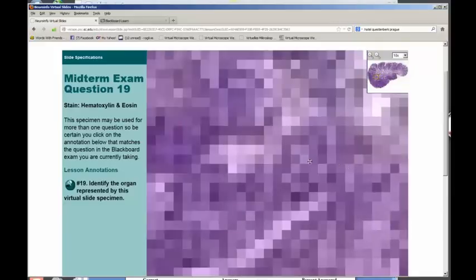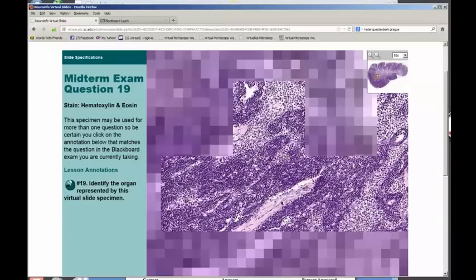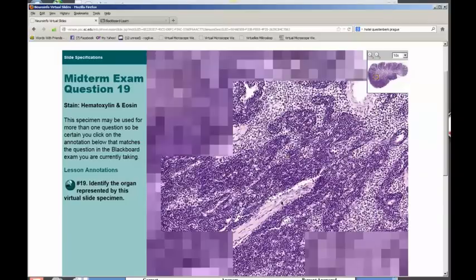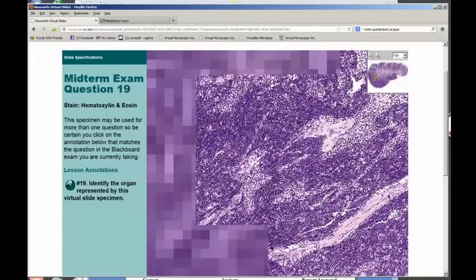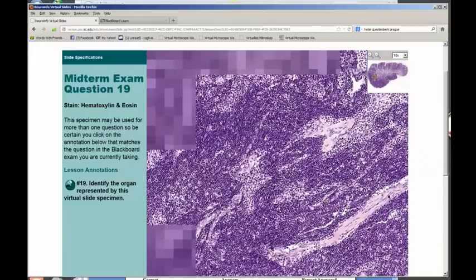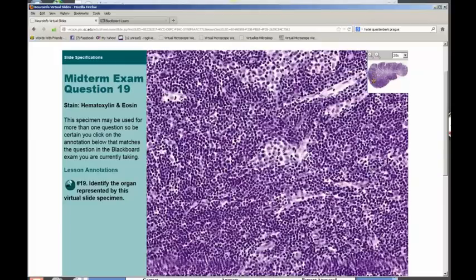So again, if you move to the outside and move through the deep cortex, where you'll find most of the T lymphocytes, and remember those special vessels. Let's see, I don't know whether I can find one or not. I'm going to pause this and see if I can find a high endothelial vessel. Just a moment. So this is an example of a high endothelial venule.